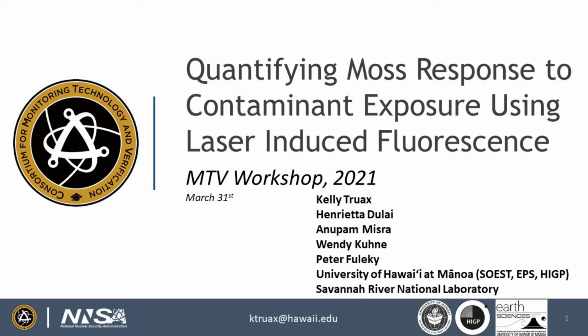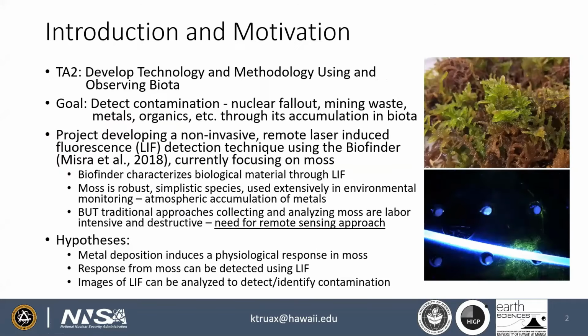Welcome. My name is Kelly Truax, and I will be presenting our research under the MTV Consortium, focusing on quantifying moss response to contaminant exposure using laser-induced fluorescence. More specifically, the research is placed within Thrust Area 2 and is focused on developing technology and methodology for non-proliferation by detecting contaminant deposition using and observing biota.